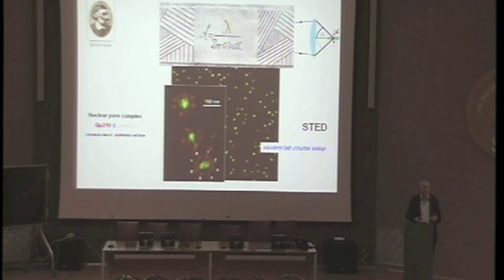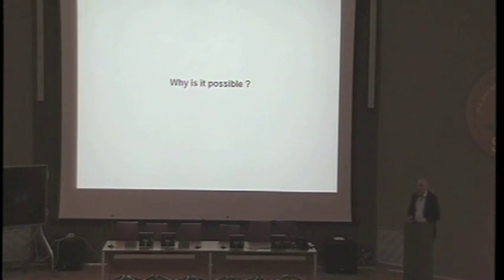Being a physicist, of course, I always try to ask, what is the reason why something works? And so here the question is, what is the reason why we can take these images now, but say 20 years back, everyone said, no way, you won't get better than what you've seen before. And so I will concentrate on the question why.